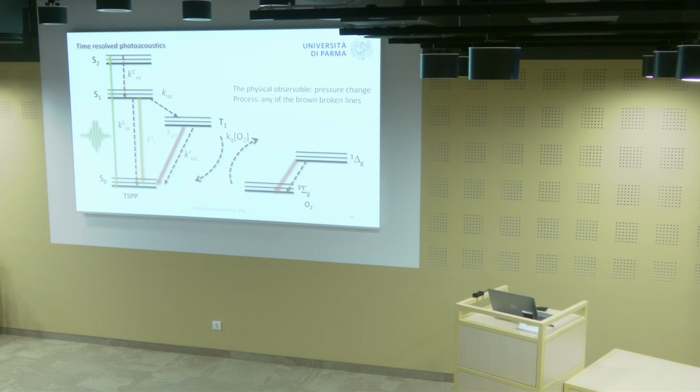Okay, so I'll say just a couple of words on time-resolved photoacoustics. I like photoacoustics very much, as some people in the audience know. For historical reasons, my PhD thesis was on that, so my heart is with photoacoustics. It's not very fashionable, but you will see it's very useful.